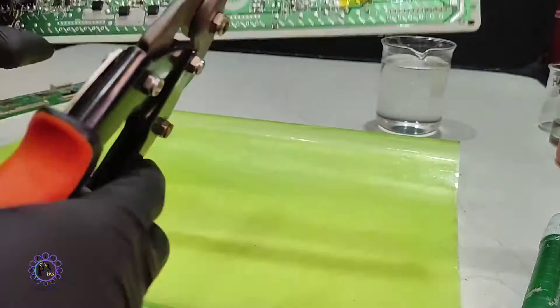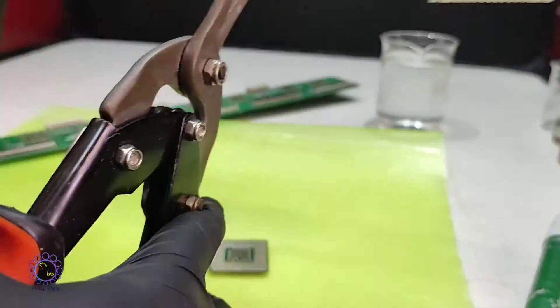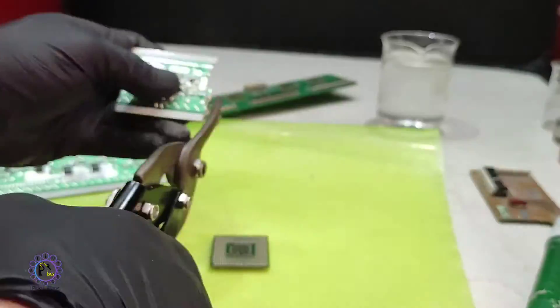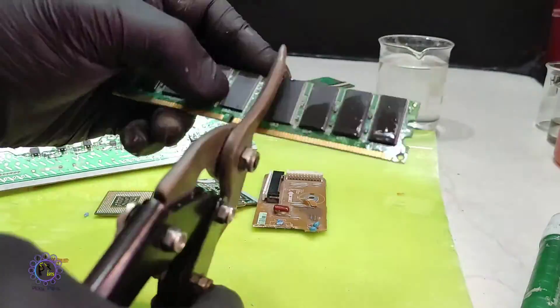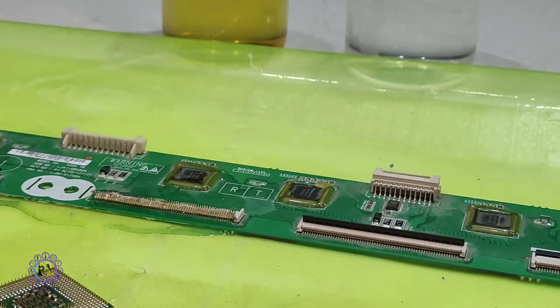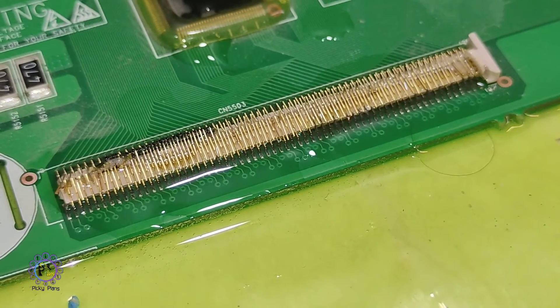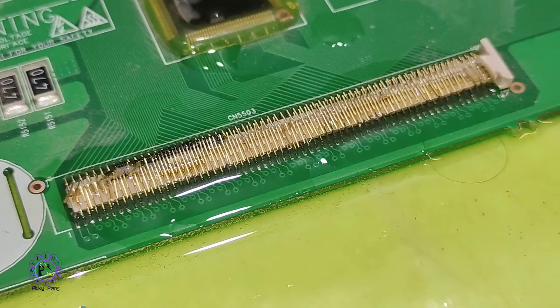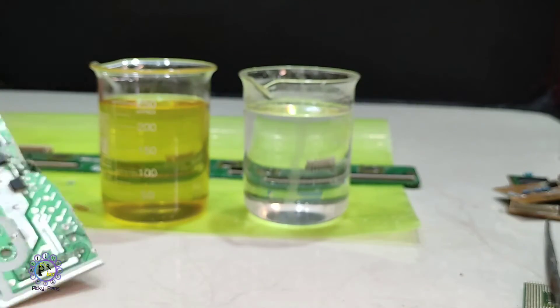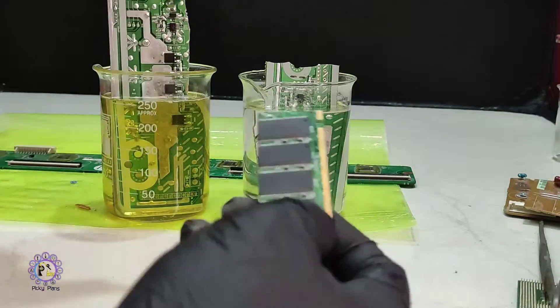Now that I have both solutions prepared, I also wanted to prepare some PCB boards, computer parts, and gold-plated pins to be tested with the tin stripping solution. First, the ammonium quaternary-based solution is poured over the first pin, and then the urea-based solution is added to the second pin for comparison. After a few minutes, the pin solder starts to get dark, which means tin was being dissolved and the gold plating remained untouched. The same was happening to the urea-soaked pins. I also decided to dip some PCBs into the solutions to check their ability to dissolve wider solder areas.